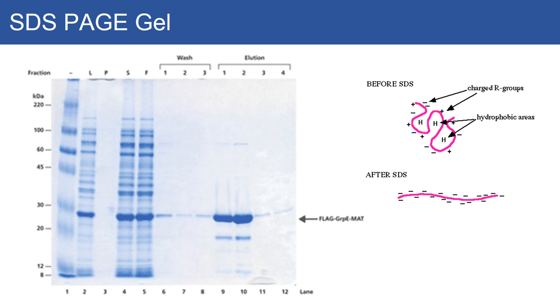Again, SDS page gel is used. The sample can be very dirty, but the idea is to see if we have the protein we're looking for in the sample. And gel electrophoresis. Electrophoresis is basically separating by charge, and we're going to see this in other biomolecules.